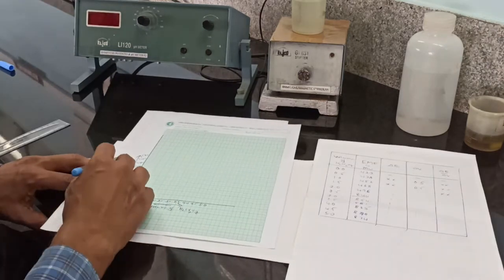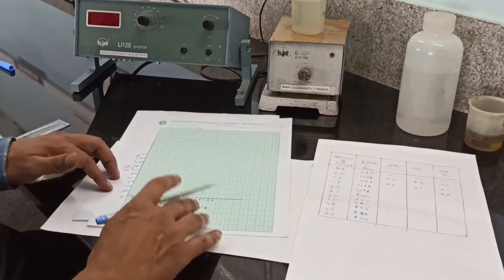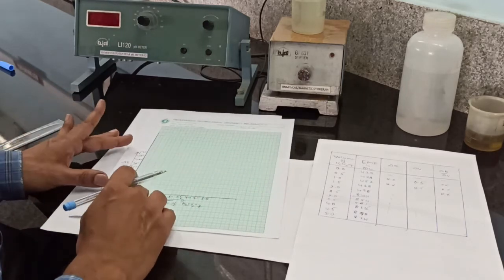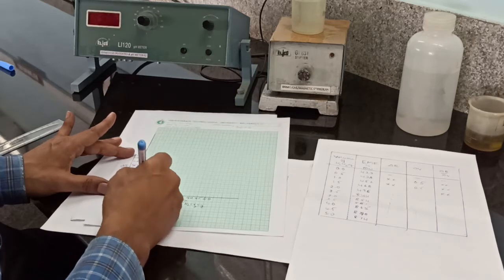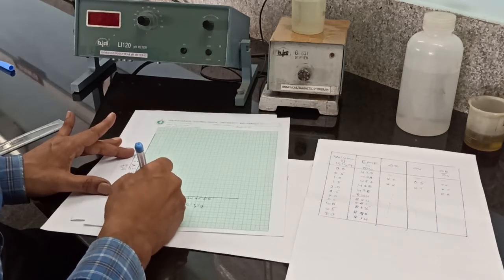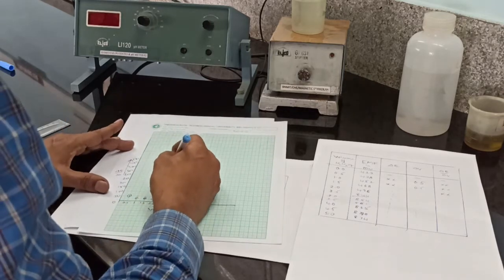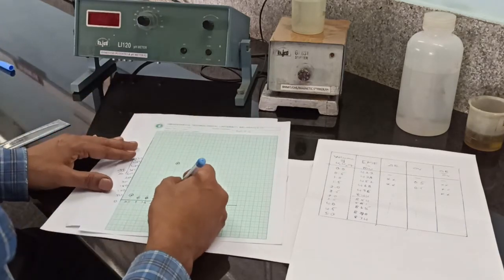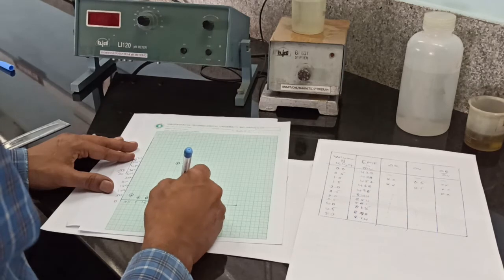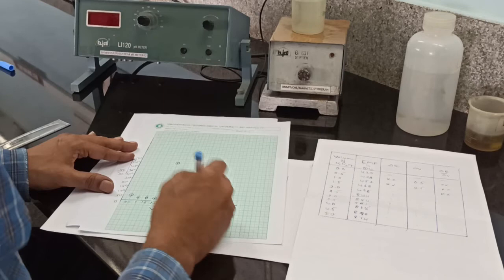Plot the graph of delta E by delta V versus volume of potassium dichromate. For 0, there is no value. At 0.5, so here is the point, put a cross mark and circle it. At 1, 1.5, 2, at 2.5, you observe the rapid rising EMF. So here is the point. At 3, 3.5, 4, 4.5 and 5.